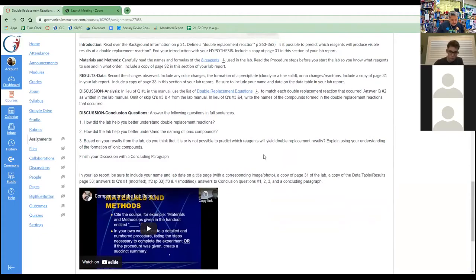Okay, so let me get a well plate, and then we'll get these chemicals together and see what happens. I don't have my 96 one, but I have the other well plate. Oh, and I don't have the camera up, so let me swap that. No, that's not what I meant to do, but that's one way of doing it. Go over there and share. Okay, and then using a very small quantity of chemicals, but we do want to be safe.